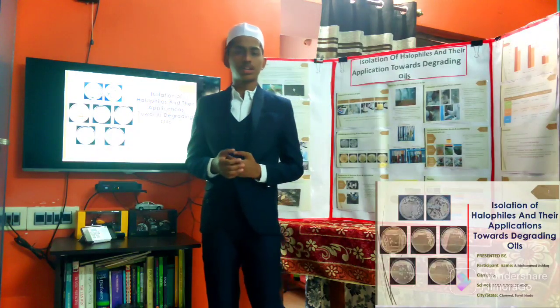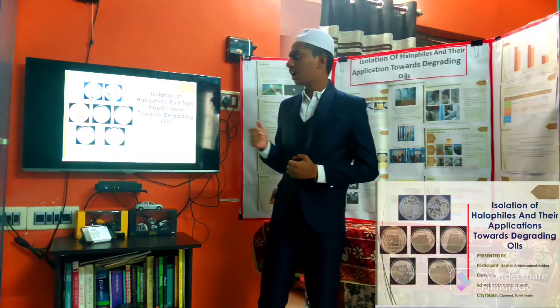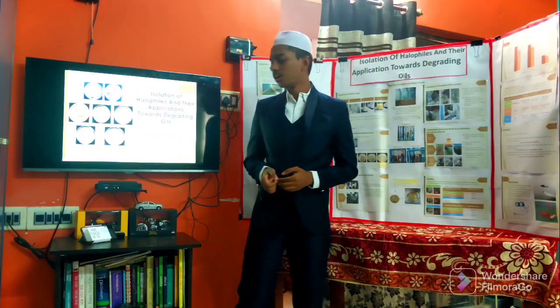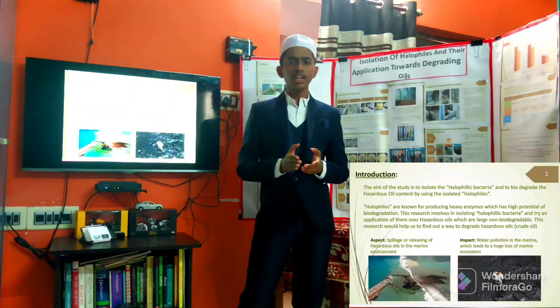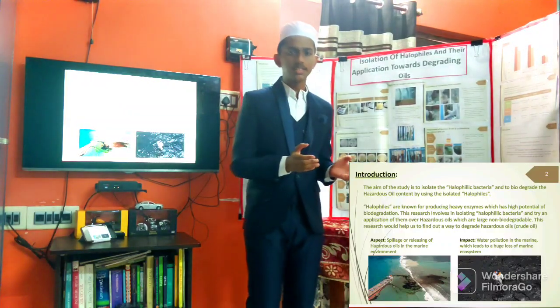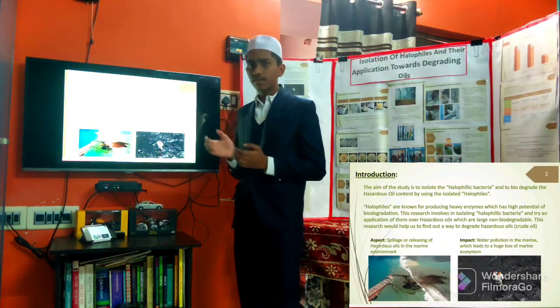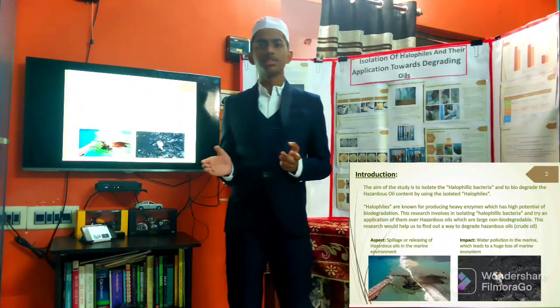I am Muhammad Ashfaq of Grade 10, here to present on a wonderful research project, isolation of halophiles and their application towards degrading oils. First of all, what are halophiles? Halophiles are defined as salt-loving organisms. These are found in extreme places like oceans, salt lakes, and seas. The aim of this project is to isolate these halophilic bacteria and biodegrade non-biodegradable items in the oil.